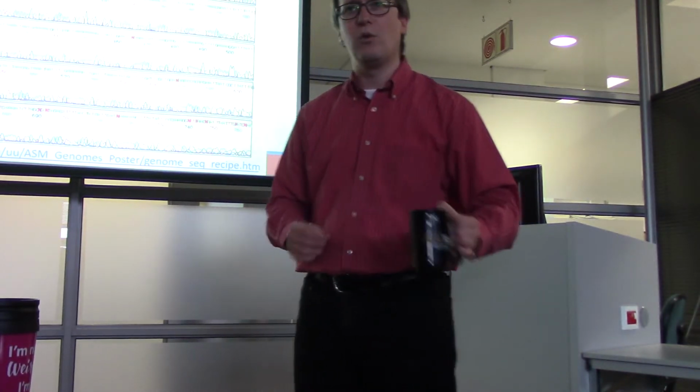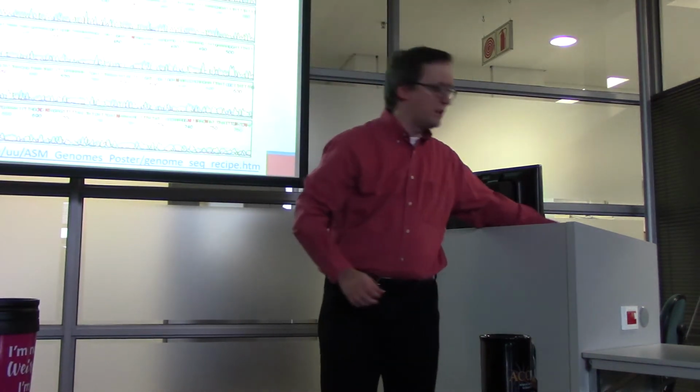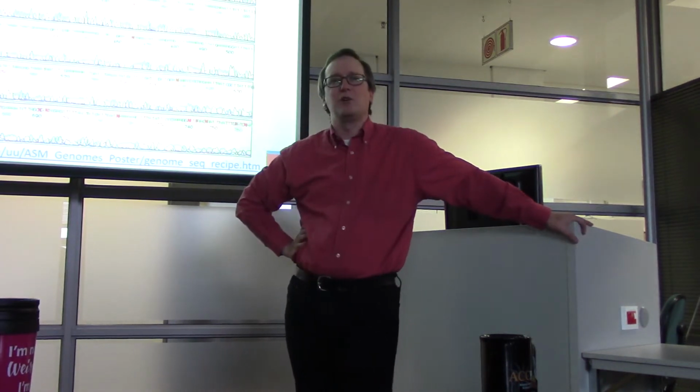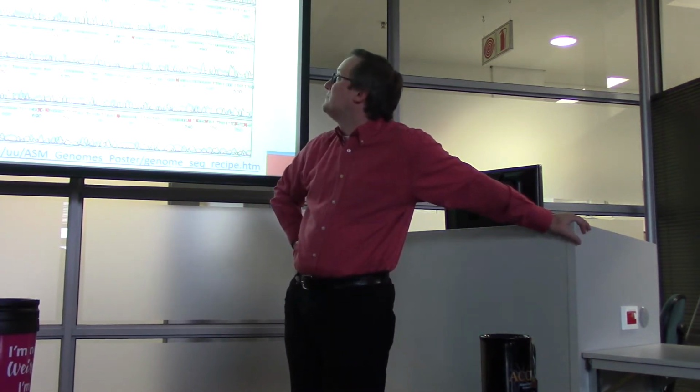Okay, now let us talk a little bit about sequencing quality. So I mentioned Phred scores, and probably one of the first things you notice when I put this slide up is that it's deeply old school. Everyone, can you see the tiny little print up there at the upper left-hand corner, what this is coming from? It's coming from an ABI Prism Model 377.